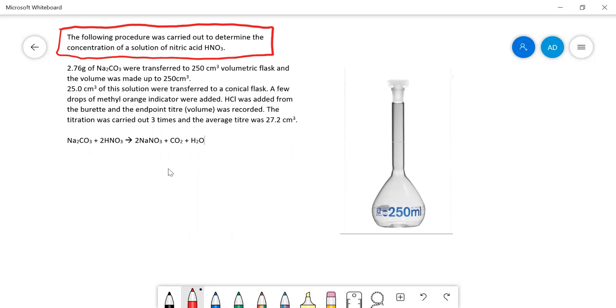What you'd get is 2.76 grams of sodium carbonate transferred to a 250 volumetric flask. Now we've never used a volumetric flask before, but this is a volumetric flask, and you will be using these next year.